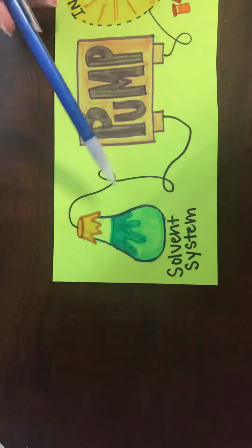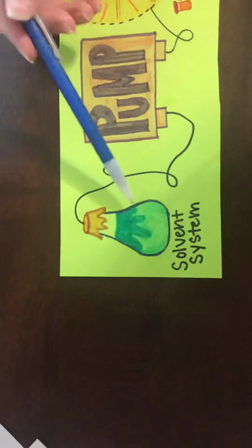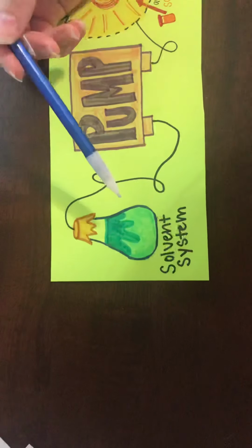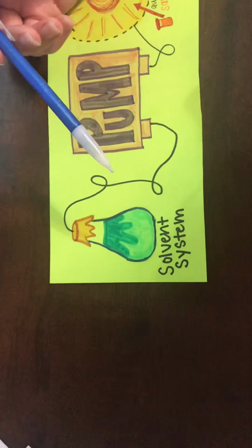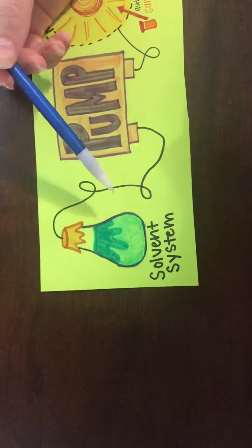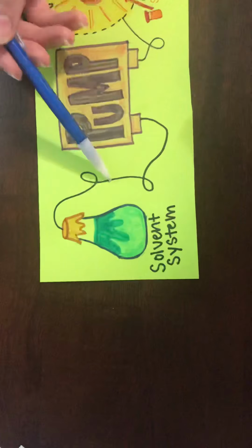So we start off with our solvent system. And I know I just drew one, but there's multiple solvents in the solvent system, but they're kind of hard to draw, so let's go along with it. So the HPLC utilizes a multi-solvent system. This allows us to control the amount of compound components that are going through the column at any given time. So we can change the polarity of our mobile phase by changing the ratio of the solvent system, so using more of one solvent than the other.